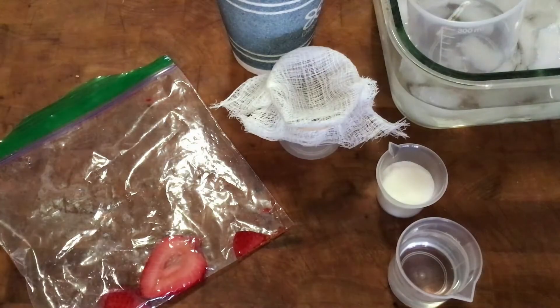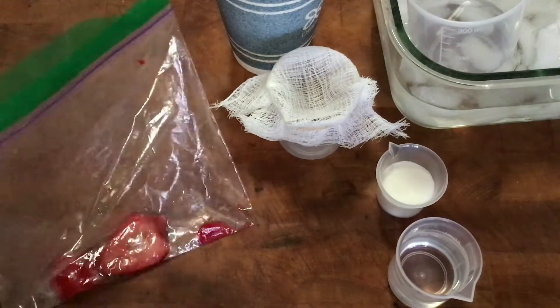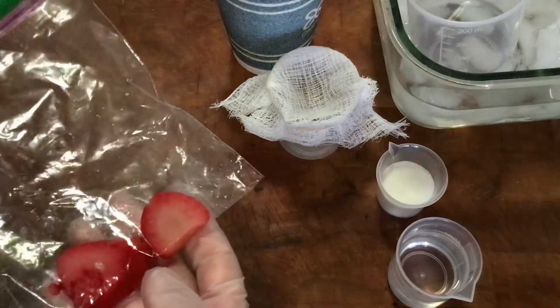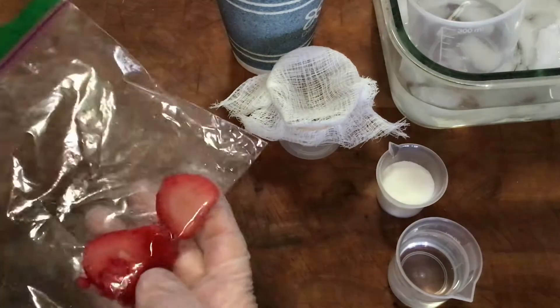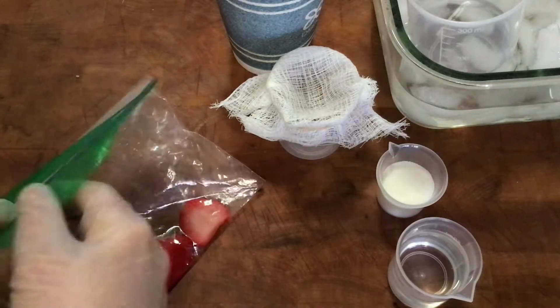This video is going to step us through the investigation students do in small groups where they're extracting genetic material from a strawberry. I'm starting here with a thawed frozen strawberry in a bag. It's nice that it was a frozen strawberry because that process breaks the cell walls and it makes it easier for students to mush it up.